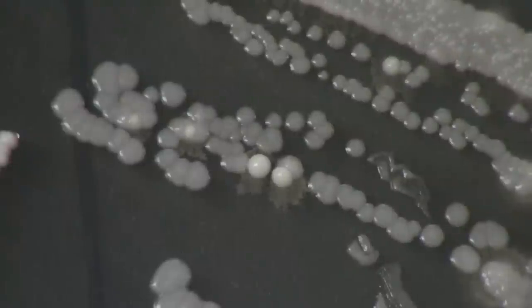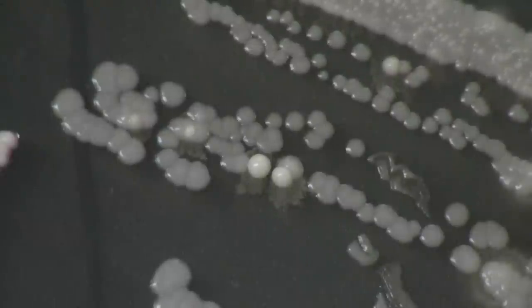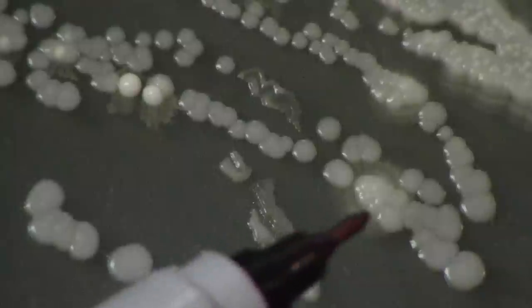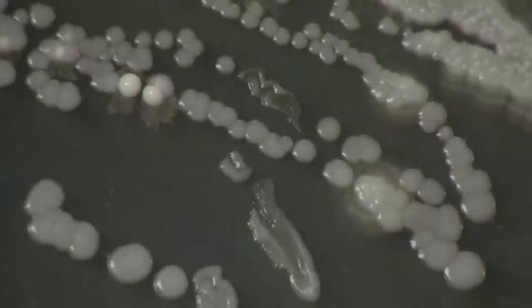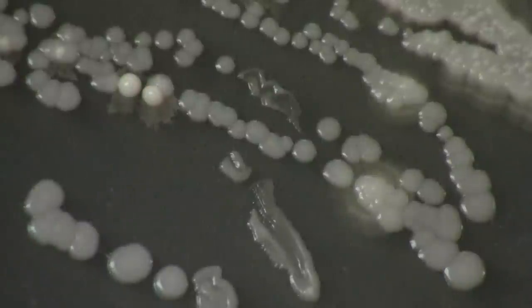Here's another example of something to avoid, and there are actually two things that give away something a little scary. First, if you look here, there's this sort of filamentous, fuzzy-looking growth — and down in the corner you can see more of it. That's mold. Some molds are toxic, but all molds will make your beer taste like cardboard, so in either case you want to avoid it. The other thing — these colonies sitting on top of the mold — are what we'd call mucoid, meaning they look like they've got a layer of snot on top of them. Mucoid things won't necessarily be dangerous, but they certainly won't taste good.